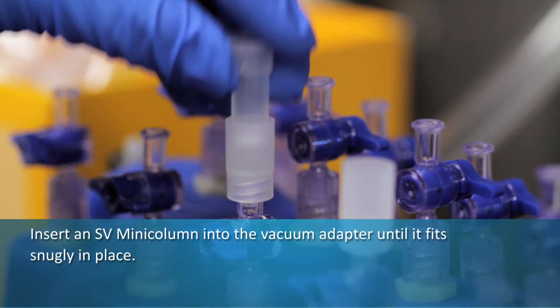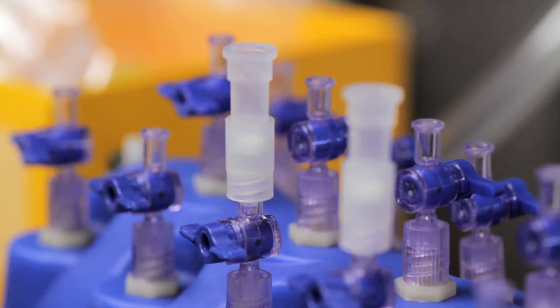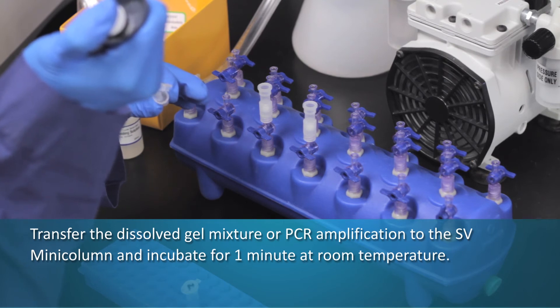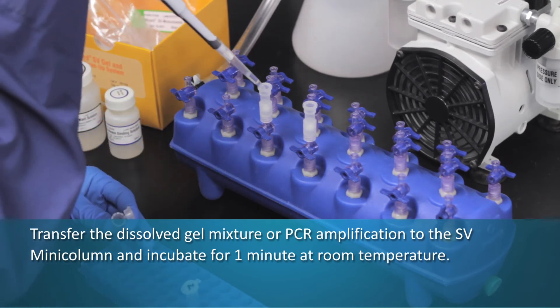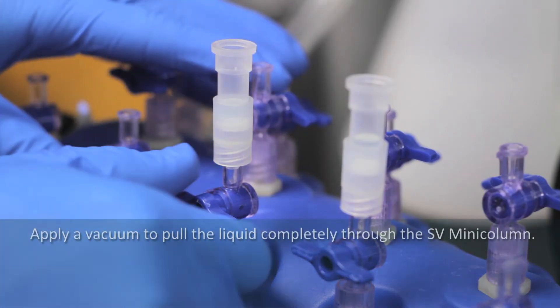Insert an SV mini column into the vacuum adapter until it fits snugly in place. Transfer the dissolved gel mixture or PCR amplification to the SV mini column and incubate for one minute at room temperature.